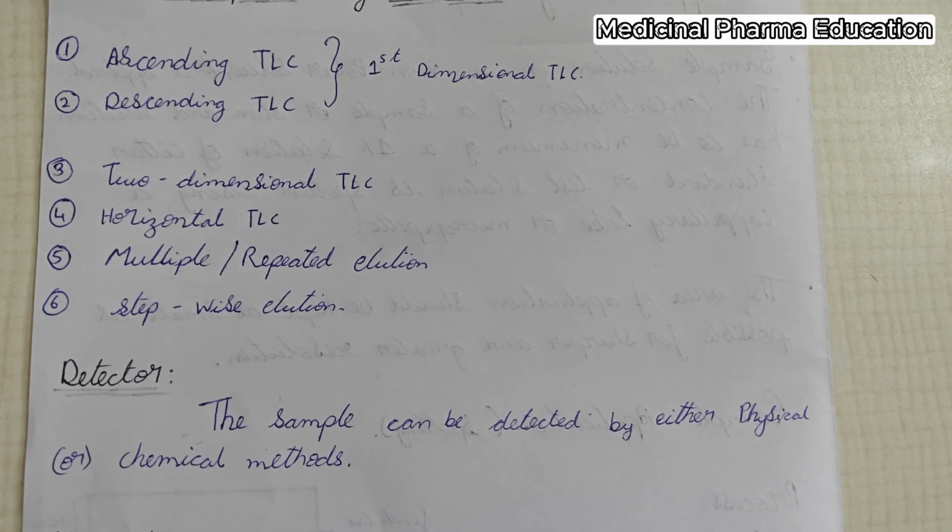Firstly, place the TLC plate in the mobile phase. The sample undergoes partial separation. This is the first process. Next, we just repeat the same. Again the TLC plate is placed in the mobile phase, and the sample separation occurs partially. This is the second step, and again we repeat the same. The plate is placed in the mobile phase and the separation of the sample is completed. That is called repeated elution.